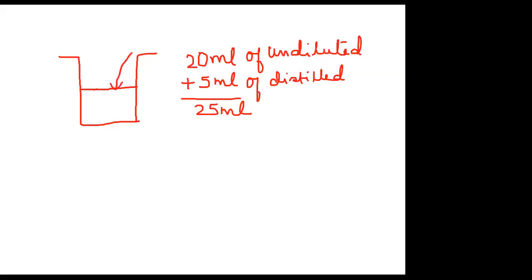As soon as you add the strip to the beaker, you start noting the time. All right. Now, what is expected? It is expected that in this case, since the solution is diluted, obviously the time taken for the magnesium strip to disappear completely will be more.